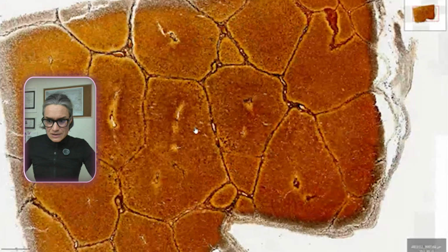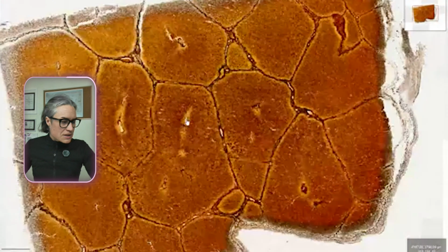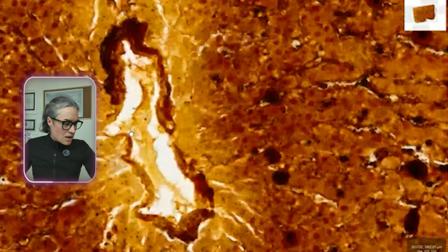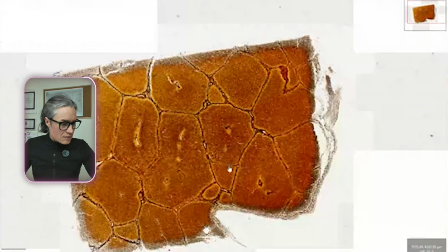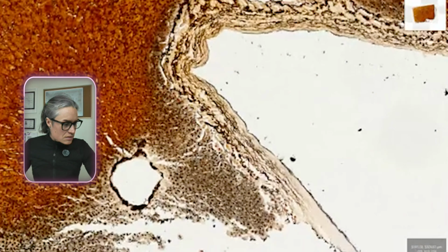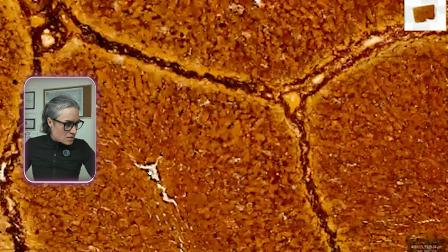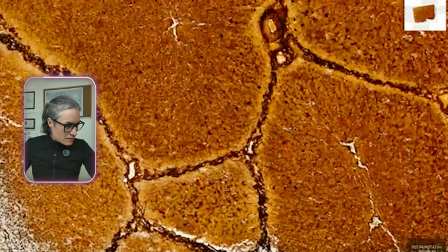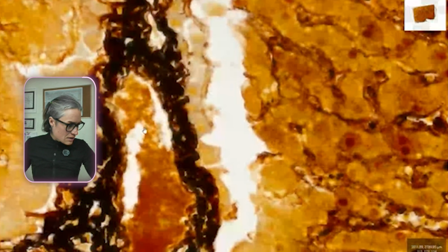Oh, this is liver in a different stain, a silver stain. So here we're not going to have the red. And where will we see red blood cells in the liver? In these vessels, central veins. But we need to find a good one that has something in it, a vessel that has blood that is stained nicely. If not, we're going to find a section of liver. I'm not very happy with the blood cells here.